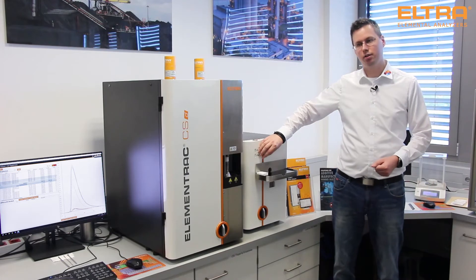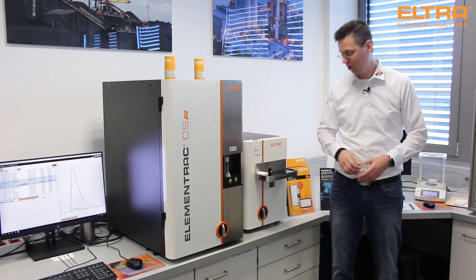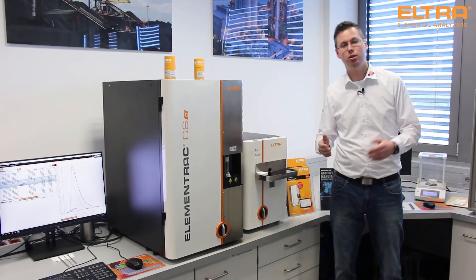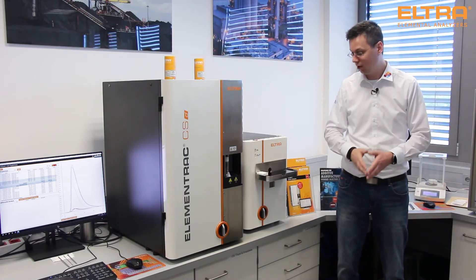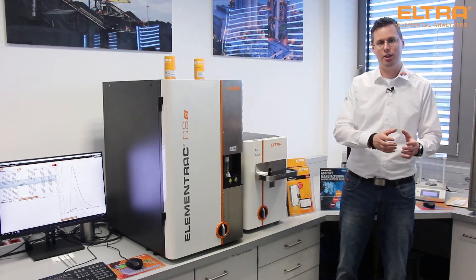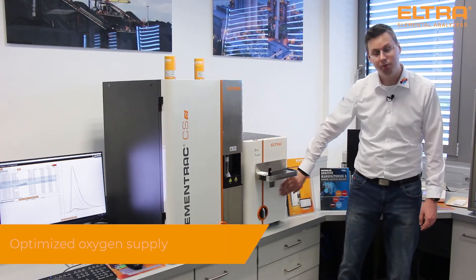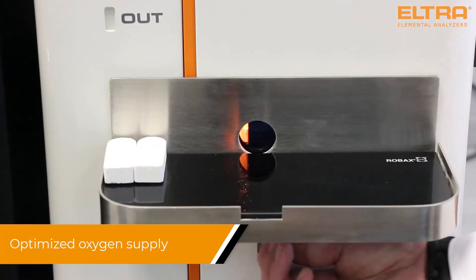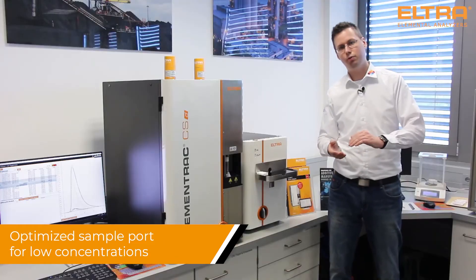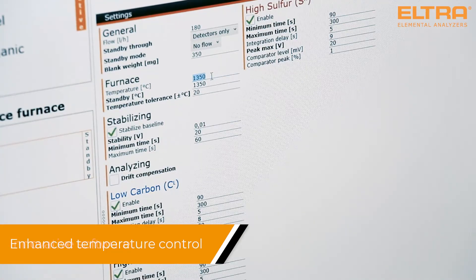Several pre-settings furnace supports you and finds the most efficient way to analyze your sample material. In the resistance furnace you can freely select the temperature between 600 and 1,550 degrees Celsius. This allows you, for example, to distinguish between free carbon and chemically bound carbon. This completely new designed furnace offers an optimized oxygen supply, optimized sample port for even the lowest concentrations below 50 ppm, and temperature controlled by our innovative element software.